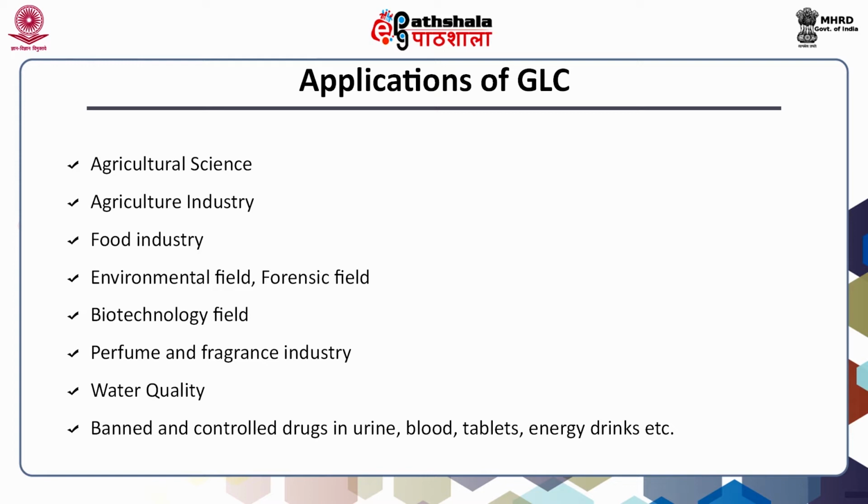GLC is very commonly used to find out the amount of pesticide residue in any food product.